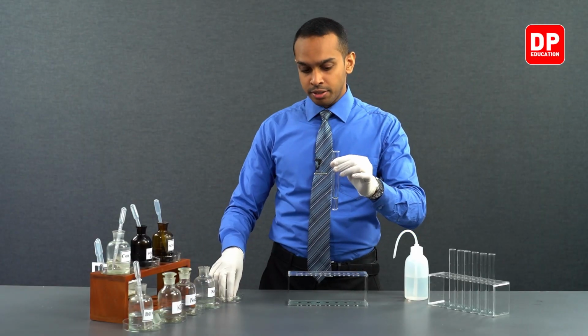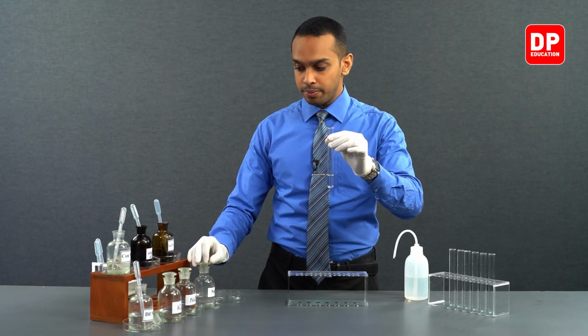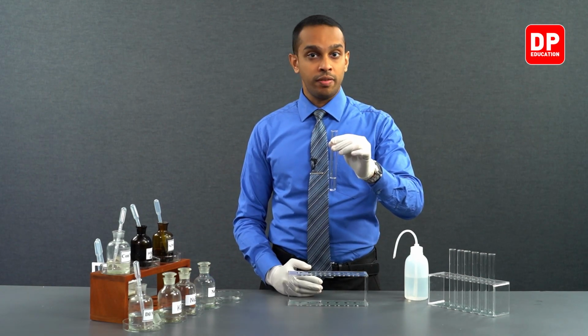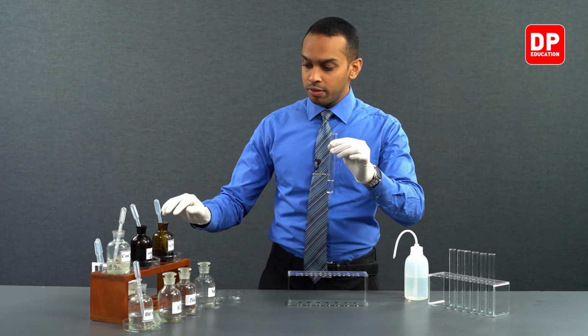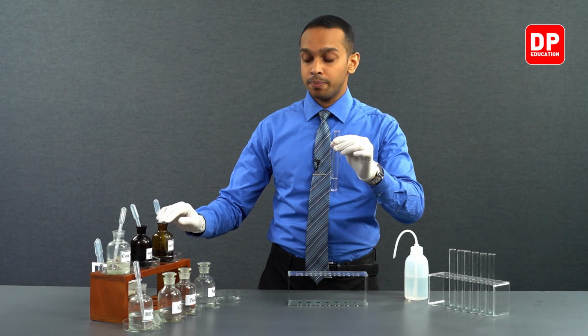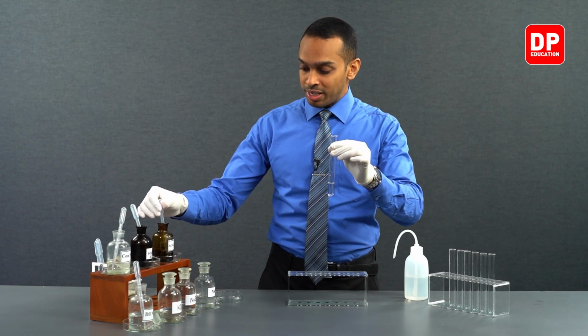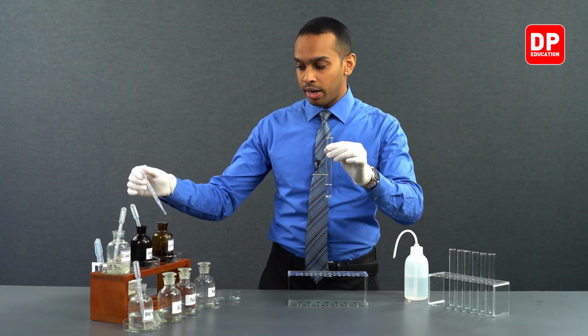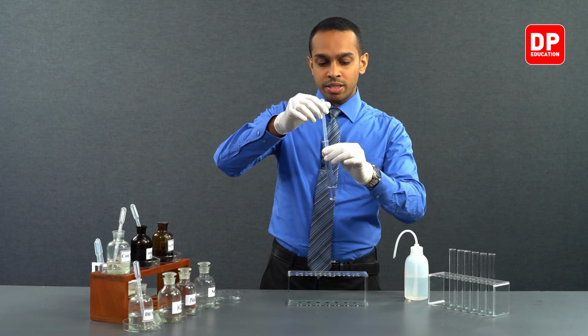After transferring a small amount of sodium chloride, I will now add a little bit of silver nitrate. Now, silver nitrate will contain silver plus ions and nitrate ions. So when silver ions come into contact with the chloride ions, we will see what happens.